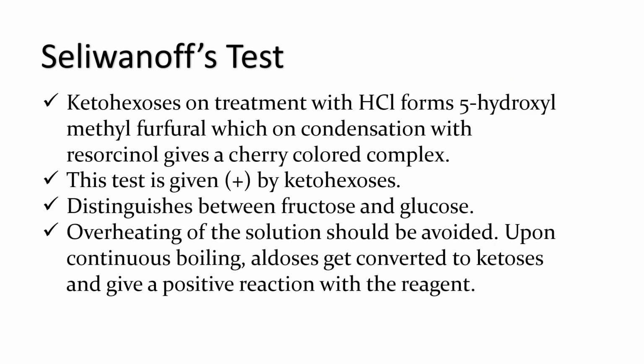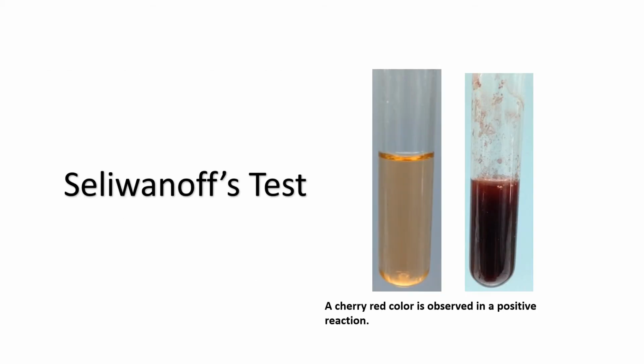For our next test, we have Seliwanoff's test. Ketohexoses on treatment with hydrochloric acid form 5-hydroxymethylfurfural, which on condensation with resorcinol gives a cherry red-colored complex. Seliwanoff's test gives a positive result if ketohexoses are present, specifically if fructose is present. For our qualitative tests, Seliwanoff's test is a confirmatory test for fructose, and it helps us distinguish between fructose and glucose. Overheating of the solution should be avoided. Why? Because upon continuous boiling, aldoses can be converted to ketoses and will give a positive reaction with the reagent.